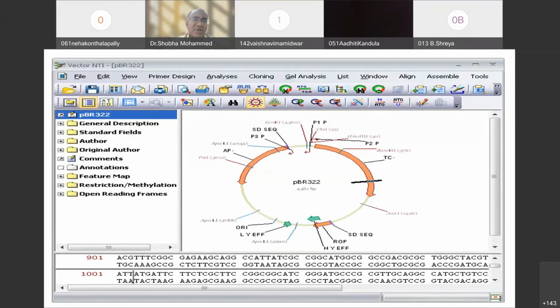So the software I'm using to form the primer is nothing but the Vector NTI. See here, I'm going to use it. I'm synthesizing the primers, because primers are the ones which help me in the synthesis of the new strands here. Don't you think it is some advantage? This is called artificial intelligence. How am I using artificial intelligence? I'm using it in diagnosis. So I have the option to select here.